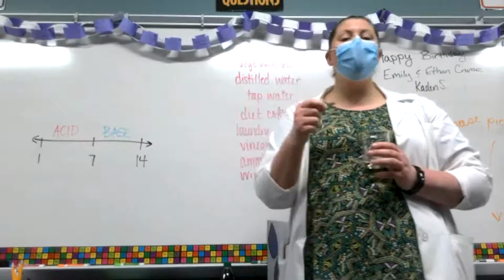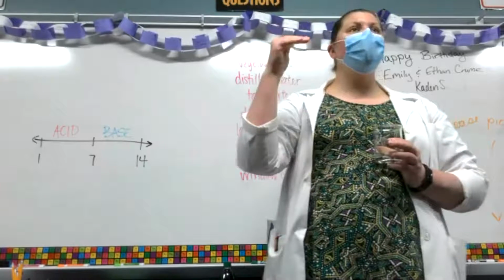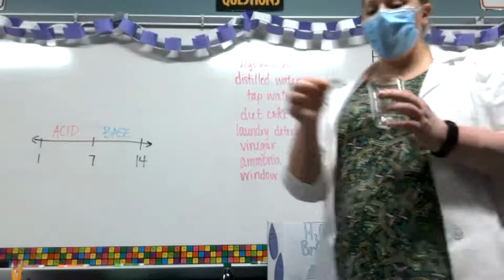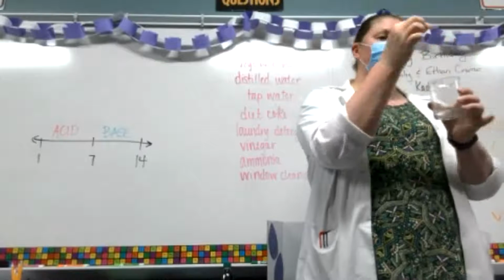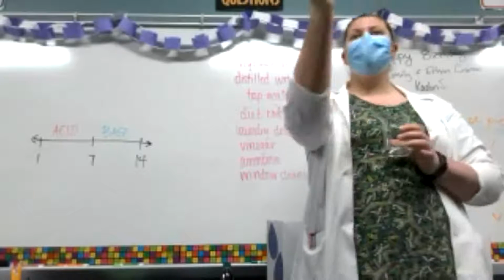Okay, so in the data table, you will write down blue and red based on how the litmus paper changes. Hopefully it's the same color, if it can be. So when you dunk them, after you rip it in half, you're just going to touch it and pull it out, okay? So I know it's fairly hard to see, but this is looking bluish, so that didn't change, okay?